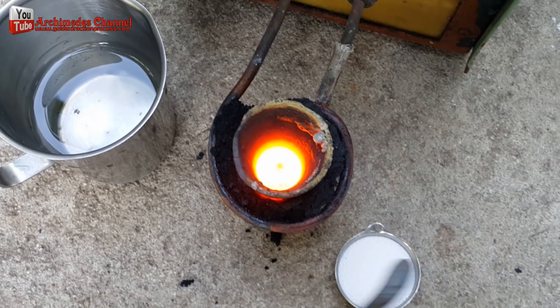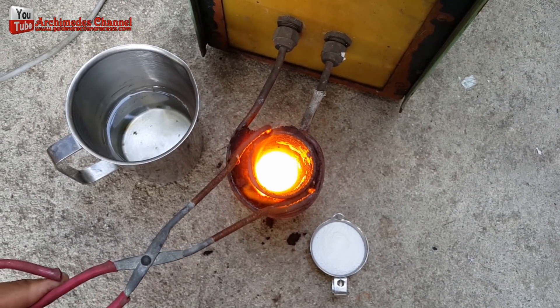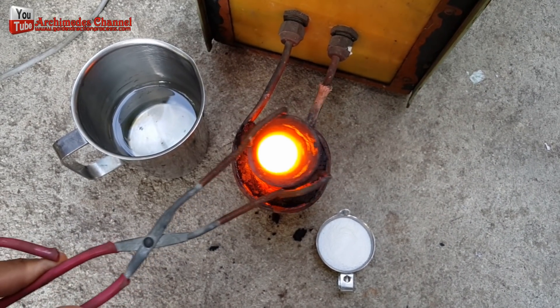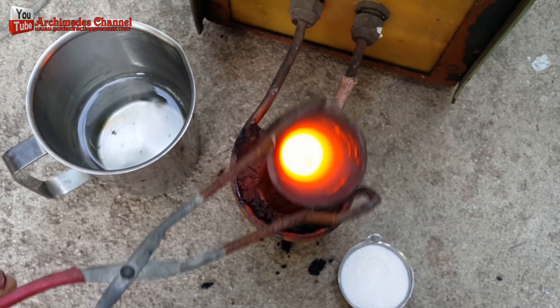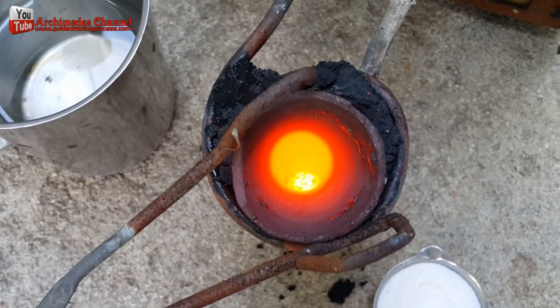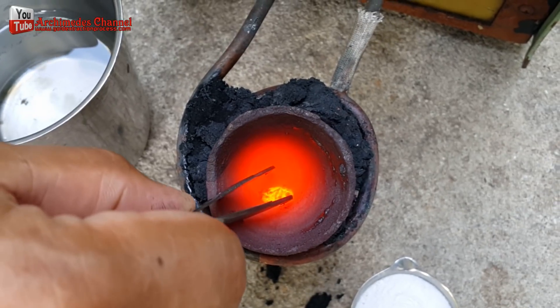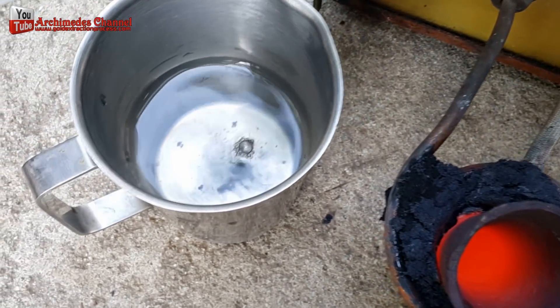After that, I added a little borax powder to further clean all particles. I then placed the hard but still hot gold particles into a mixture of two parts nitric acid and one part water. This solution further cleans the gold particles.